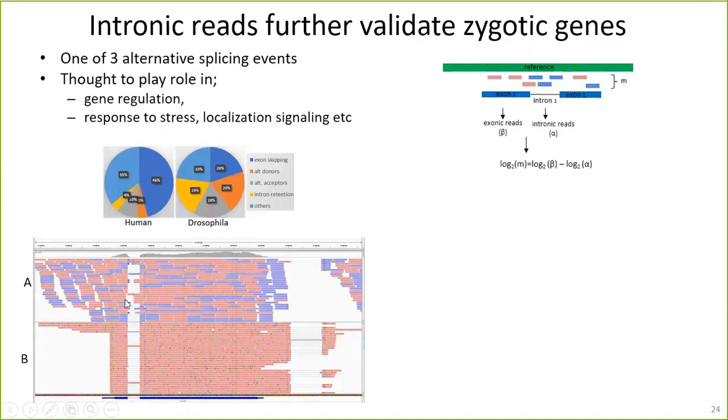How do you determine which reads are intronic, which reads are exonic? So it is not very clear. But for nanopore, you can see that this whole read is intronic, so we can nicely isolate this whole read with a lot of confidence. So the splitting of reads becomes much easier, and the computational statistics becomes quite easy.